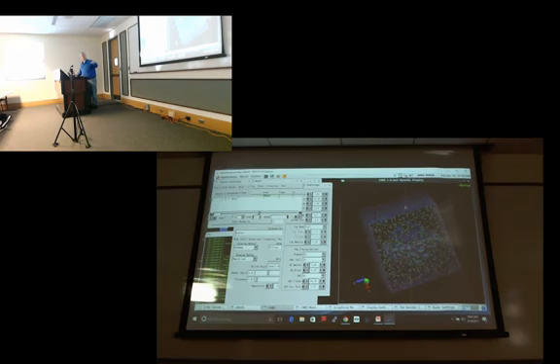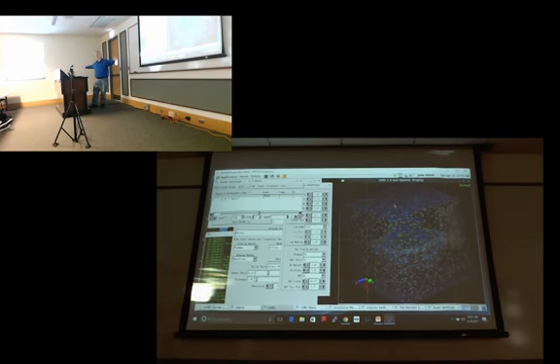But when you start working with huge structures, like something like HIV or the light harvesting structures, you may want more of an architectural view because it's like the difference between looking at a model of some detailed thing like a cell phone versus looking at a city. And when you look at the city, the orthographic view is often the better choice. I don't know, maybe Joao, would you like to comment or add anything?